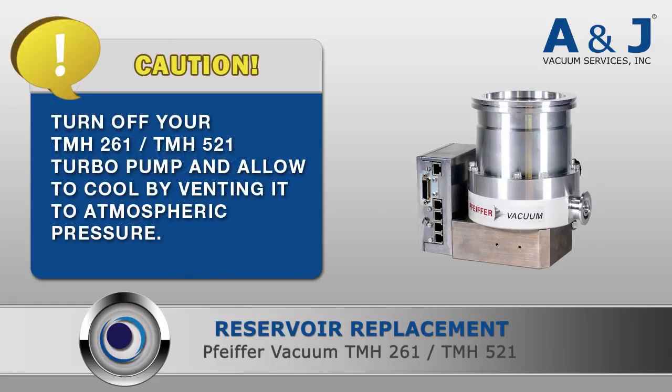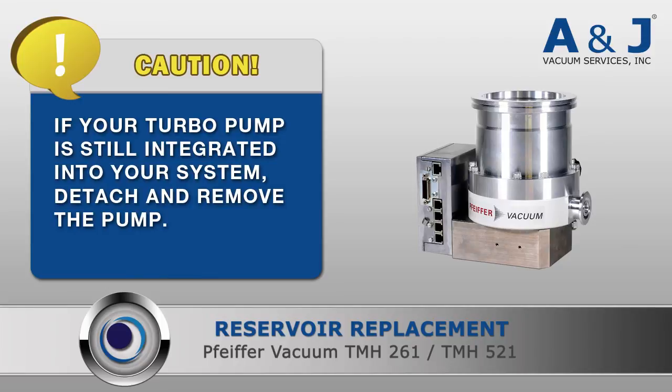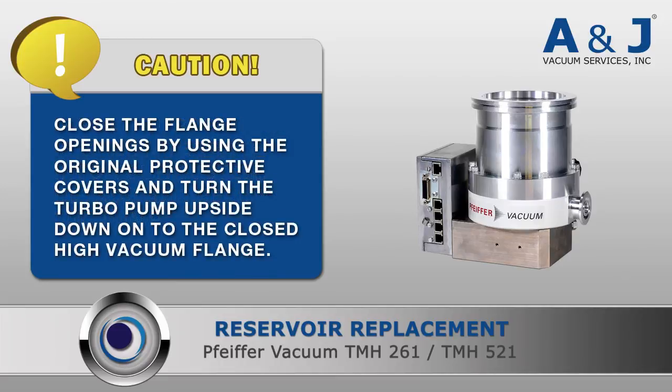Before starting your reservoir replacement, please take the following precautions. Turn off your TMH-261 or TMH-521 turbopump and allow it to cool by venting it to atmospheric pressure. If your turbopump is still integrated into your system, detach and remove the pump. Close the flange openings by using the original protective covers and turn the turbopump upside down onto the closed high vacuum flange.